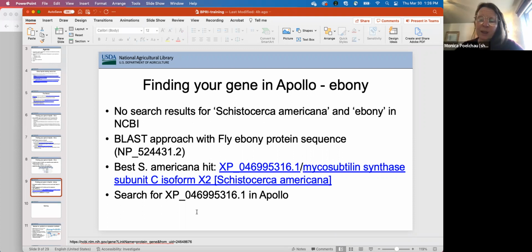And Anna, I don't know. I know Ag100Pest was working on generating new Apis mellifera assemblies. I just don't know. Presumably we have better assemblies than what's available, but they're not out yet. We're doing all the breeding lines. Those assemblies are together right now, and then we'll be doing all the subspecies as well. So it's a big giant pangenome project. But yeah, that stuff's not out yet. Yes, I like that. Not biased, but. Yeah, okay, so Drosophila is probably where it's at.